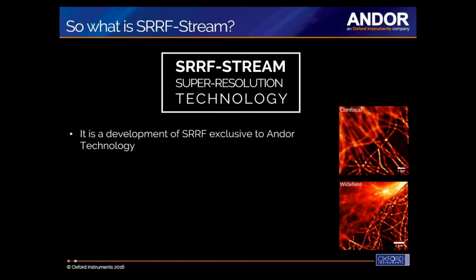Well, SRRF stream is a development of SRRF which is exclusive to Andor technology, and this came about because of a collaboration with Ricardo Henriquez, and that Andor had a lot of experience of GPU optimization for deconvolution.